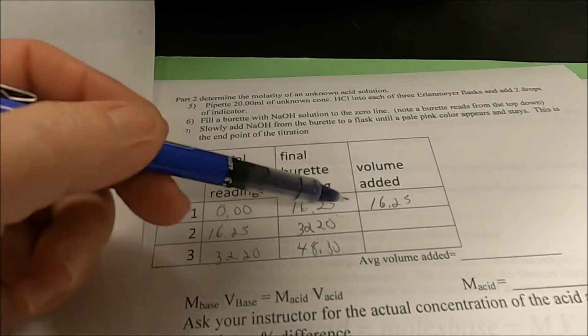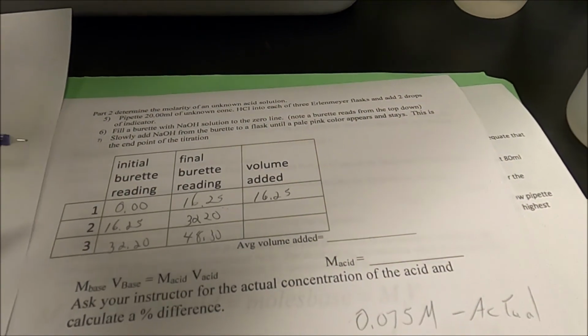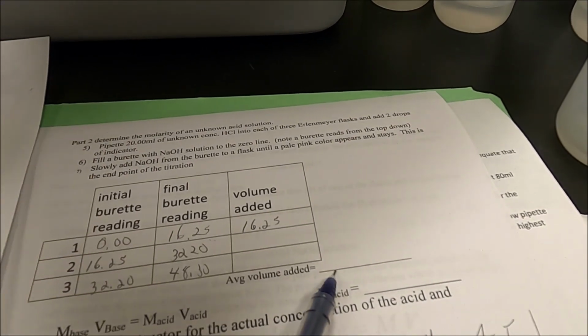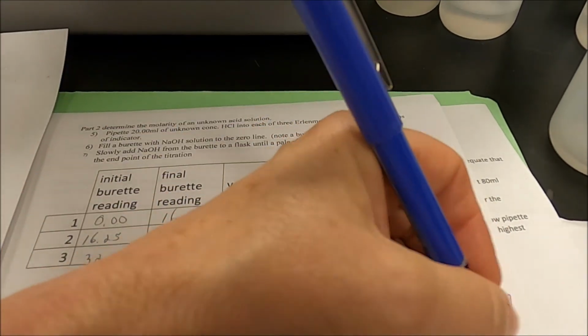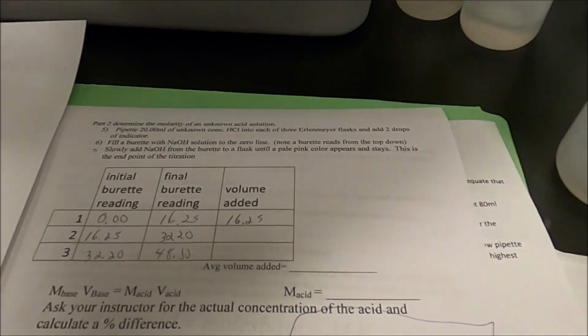So you can subtract, get your volume added, get your average volume added, and calculate the molarity of your acid. The actual molarity of your acid is 0.075 molar. So see how close you got.